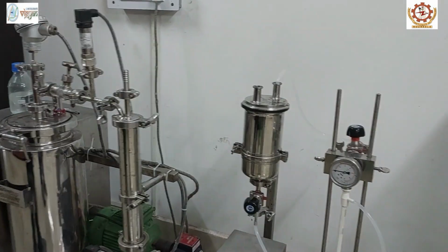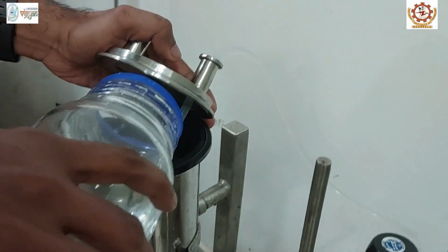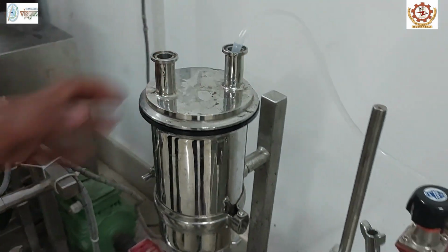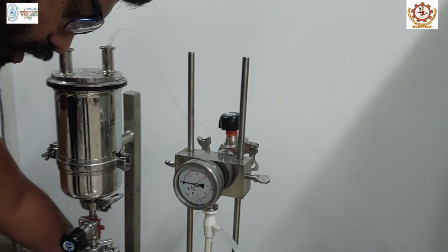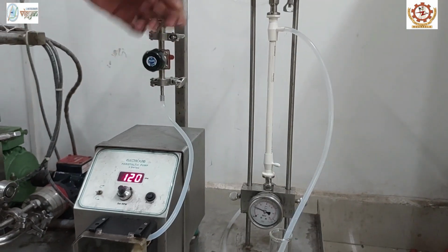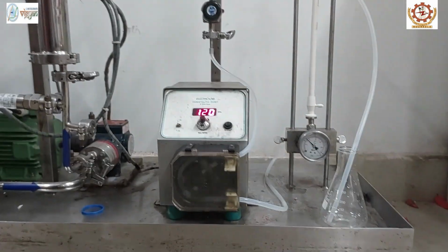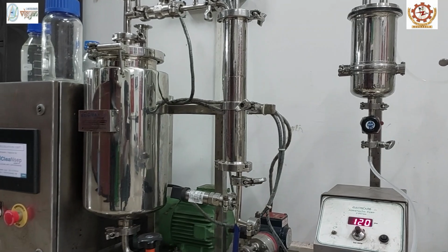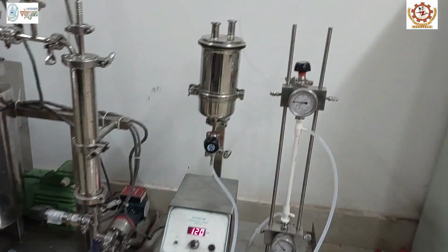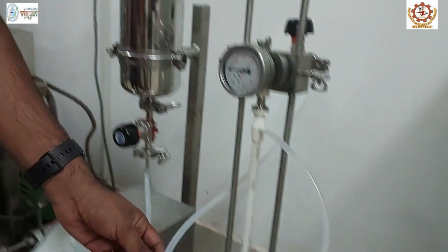Once the alkali wash is over, again we have to do water wash. 500 ml of distilled water should be added into the feed tank and switch on the peristaltic pump. Make sure that the inlet valve is open and there is no transmembrane pressure. Once the water wash is done, again collect the water back into this conical flask.